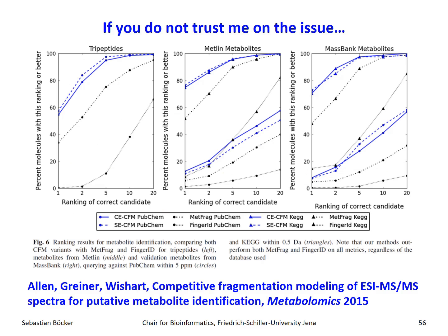And the funny thing is, this is not me who is saying that. I mean, in 2015, we had 2 papers or several papers which did good evaluations even before that, like always searching in large databases and stuff like that. This is from the paper by Felicity Allen and Greiner and Wishart, where they also report, for example, very similar plots to those I just showed you. Yeah, okay, they report the number of correct identifications on rank 1, 2, 5, 10, and 20. So it's a little bit more compressed and it is not that full, but in principle, this is exactly the same plot that I just showed you. And that's again from 2015, and those 2 papers were written completely independently. So these are the standards of the fields, and I think all future papers should adhere to them. Okay, so if they don't, be very careful.